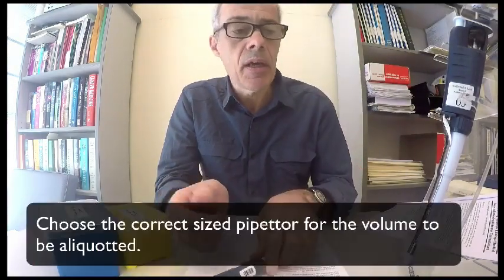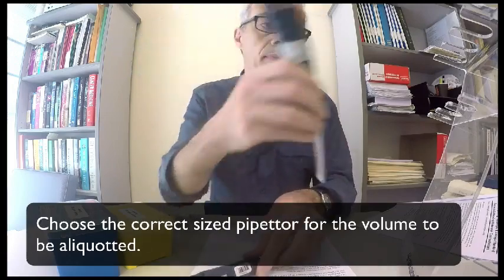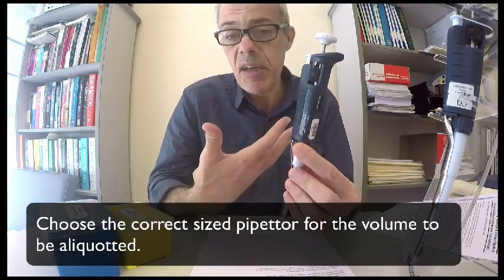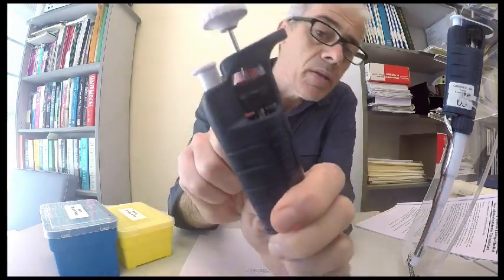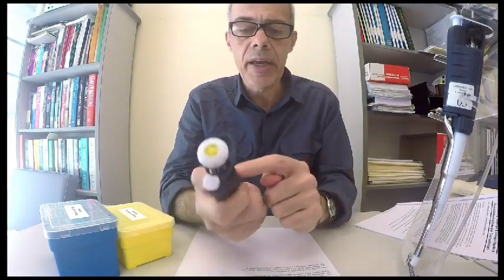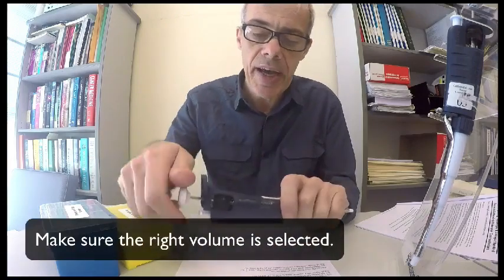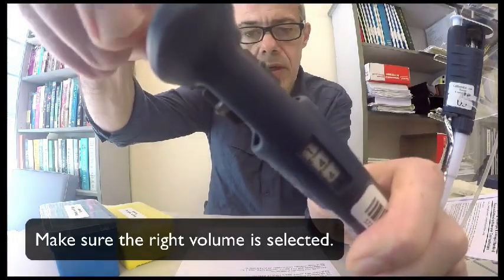If I want to dispense 180 microliters, I would use the P200. I would not use the P1000 to dispense anything that's in the range of this pipette, because this is designed to pipette between 200 and maybe, I don't know, maybe 20 microliters, maybe 10 if you're desperate. So if I want to dispense 180 microliters, I can see here from the wheel that it's about halfway. So it's a P200, it's set about halfway, it's reading 100 here. So clearly 100 refers to 100 microliters. So 180, I'll just wind it up until that number reaches 180.